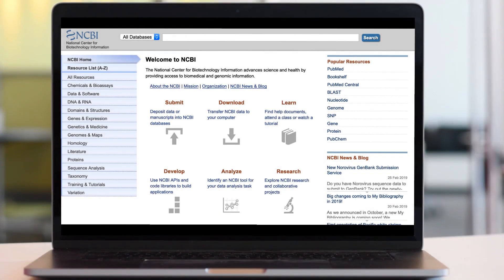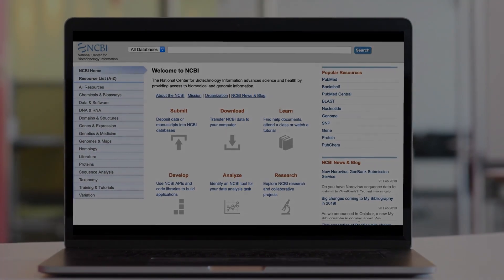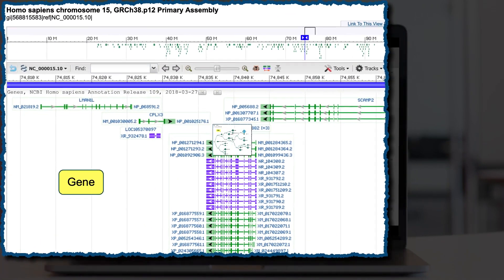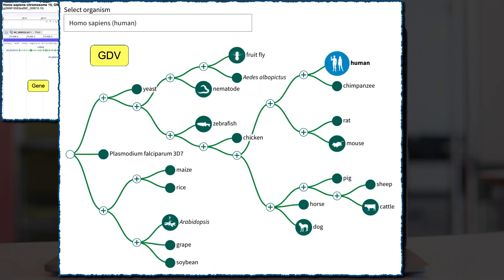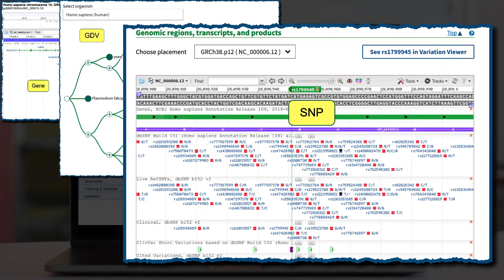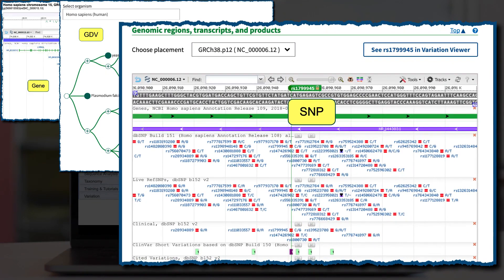This is a quick tutorial on some handy track display settings in our graphical viewers. We embed the viewer into many resources at NCBI, so whether you start in a gene record, the Genome Data Viewer, or in one of our other sequence viewers, these settings can be key to your analyses.